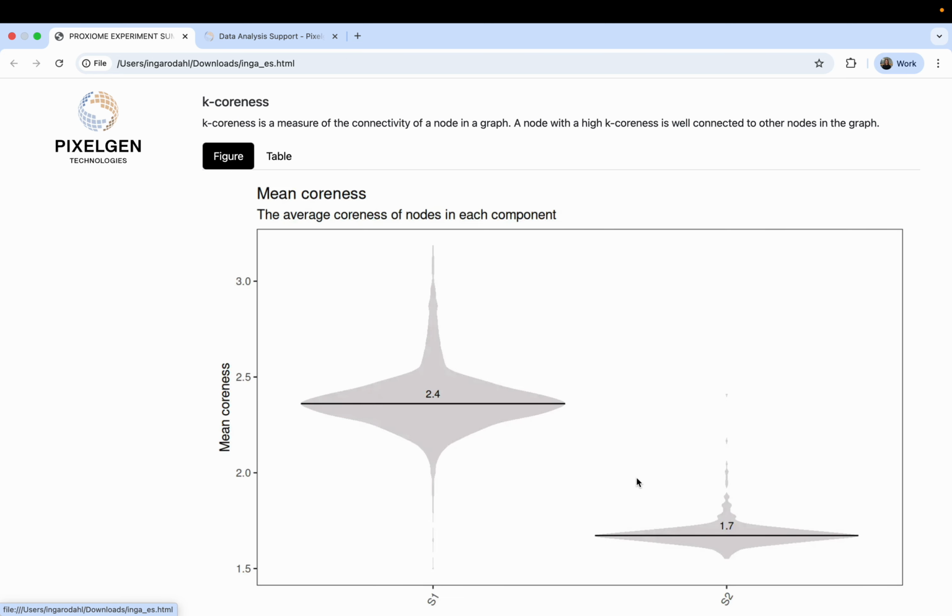So another marker that we can look at is, for example, CD8, which is expressed by the CD8 T cells, and we can also look at CD19, which is expressed by B cells. And again, this is split by sample, so if we look at another activation marker, we see that this is increased in abundance in all the different cell populations shown here.